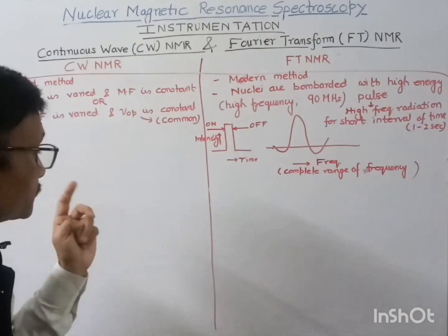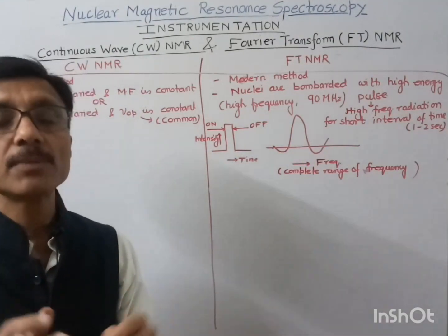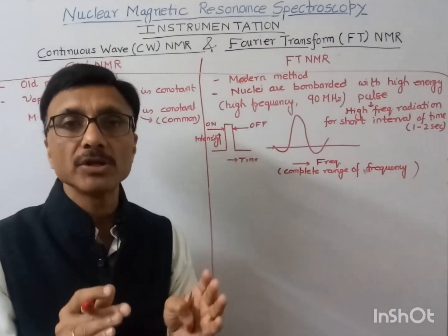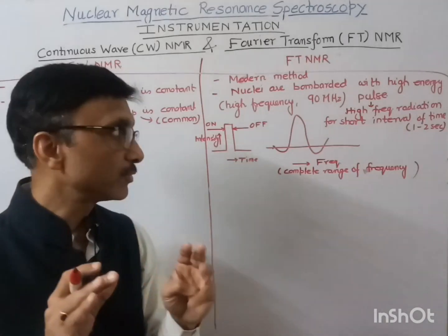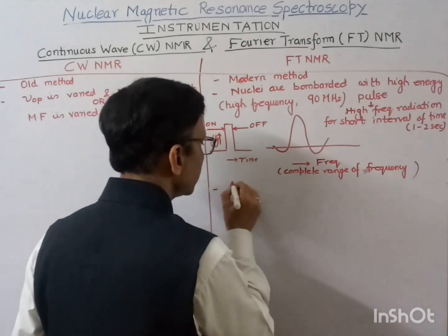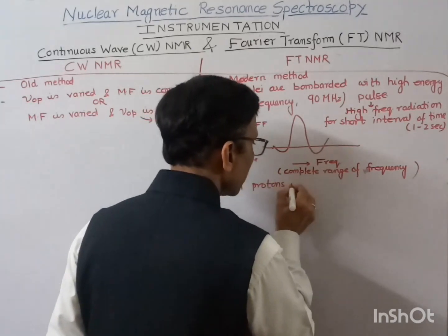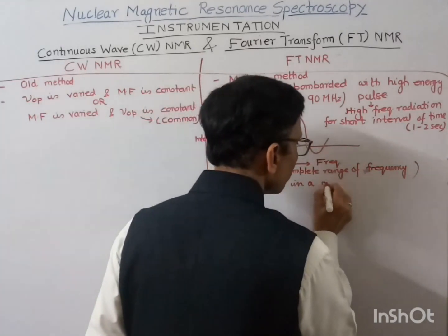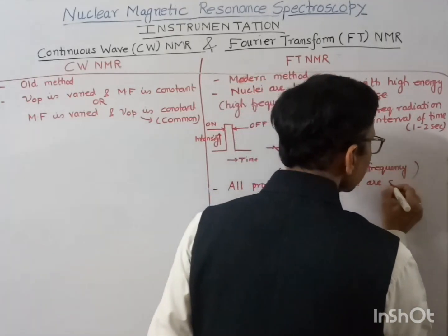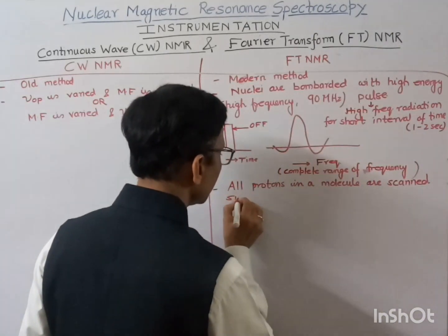That's why, as it contains the very high frequency pulse, all the protons in a molecule in a sample are scanned simultaneously. It is so high frequency that all protons are scanned simultaneously. This is a very important point. All protons in a molecule are scanned simultaneously, in one time.